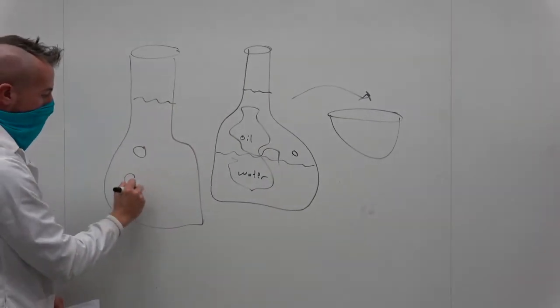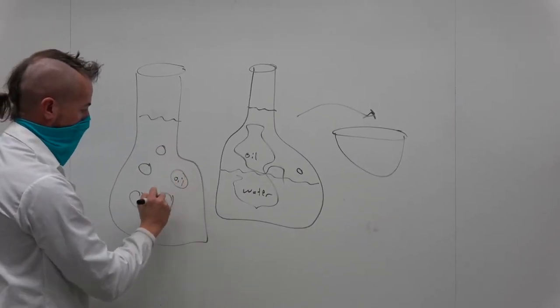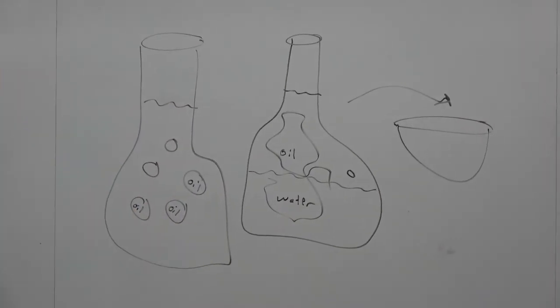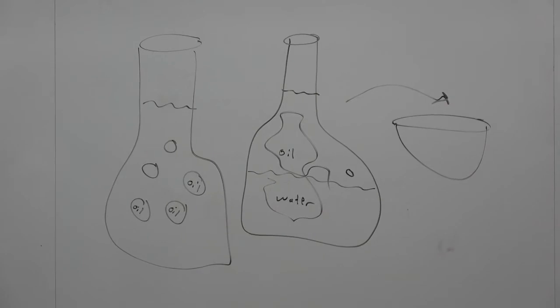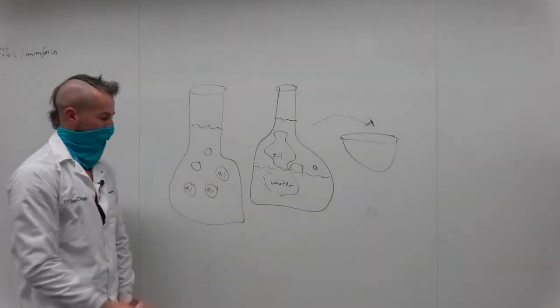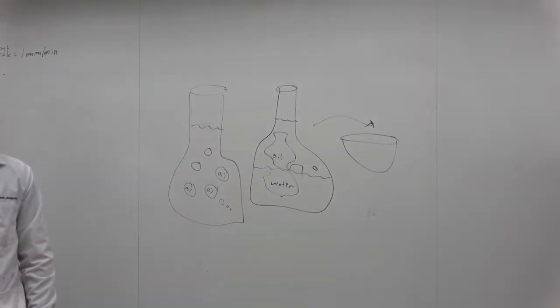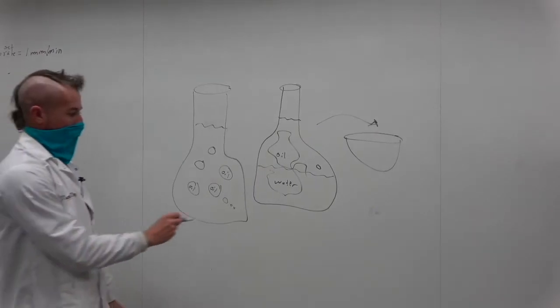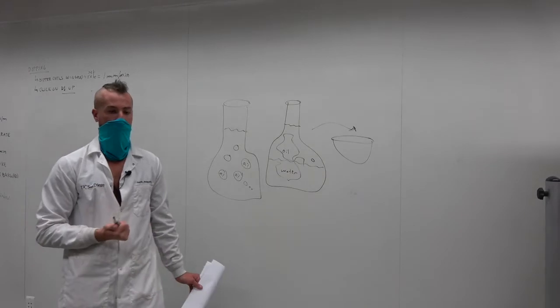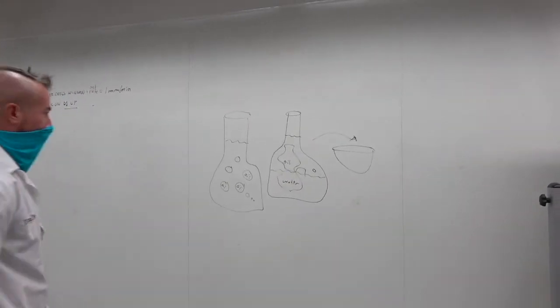You're going to have blobs of oil inside the water phase or the vinegar phase. And over time, these come back and settle up. But if we can make this smaller and smaller and smaller, we're going to make something that is a stable, colloidally stable nanoparticle. Okay? So that's kind of the big picture.